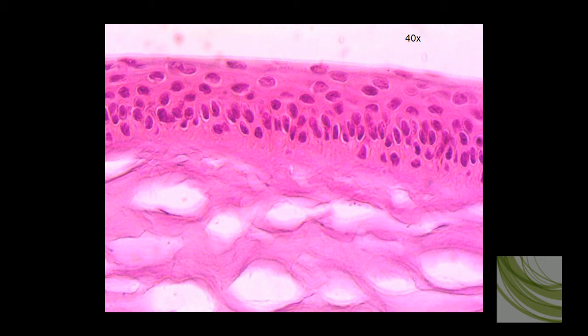Now I've increased magnification and I'm using the 40x objective. We can see the stratified cells and the basal cells. Here's the stroma.